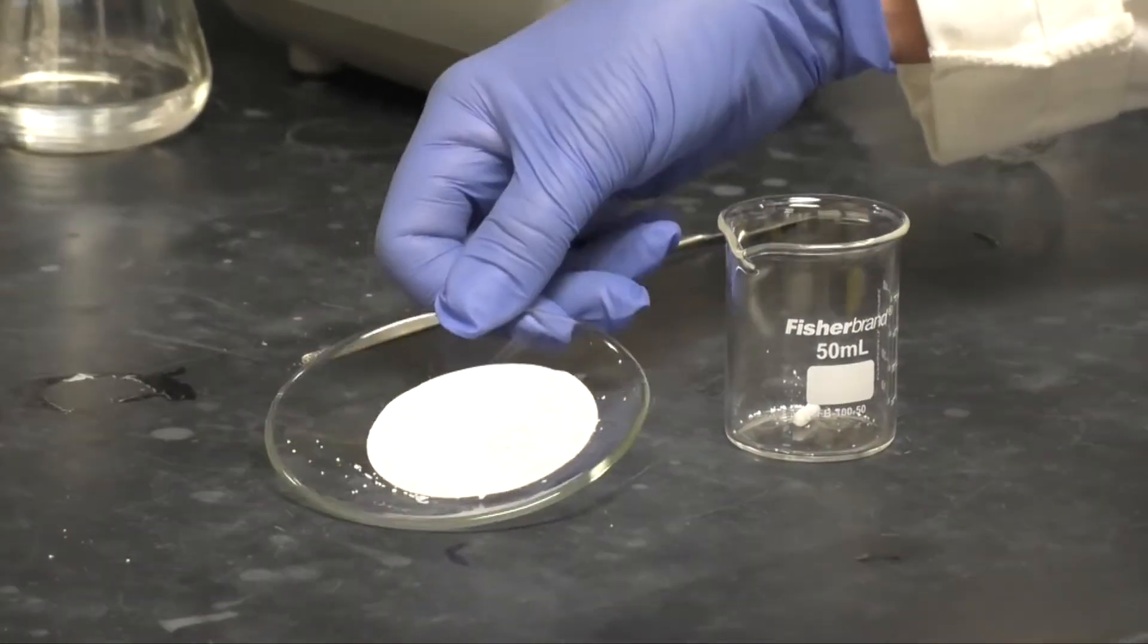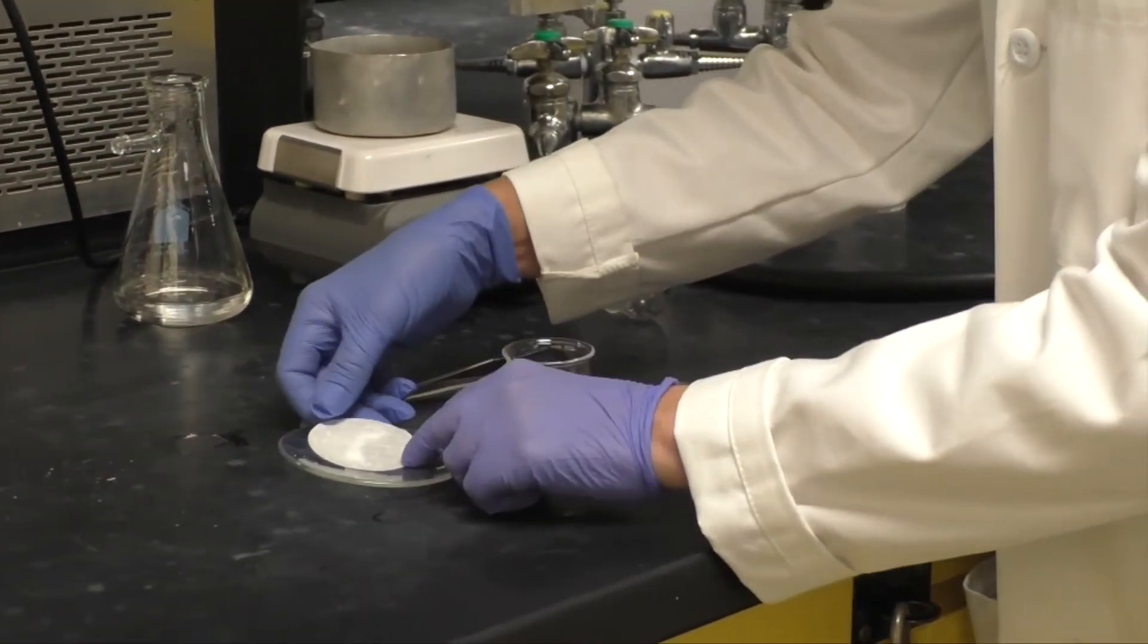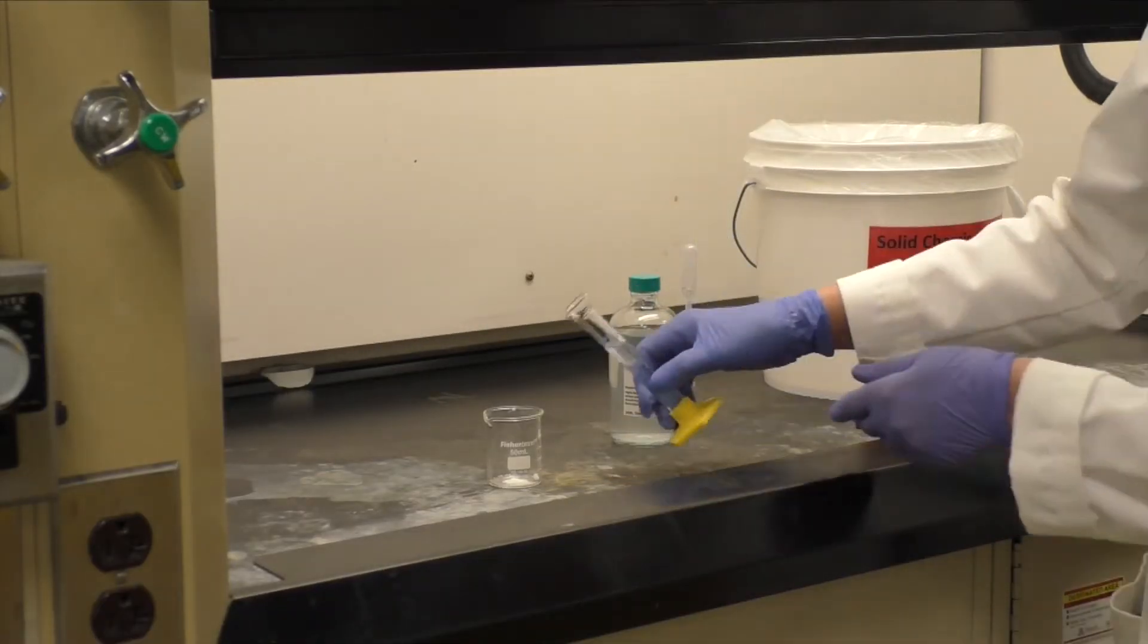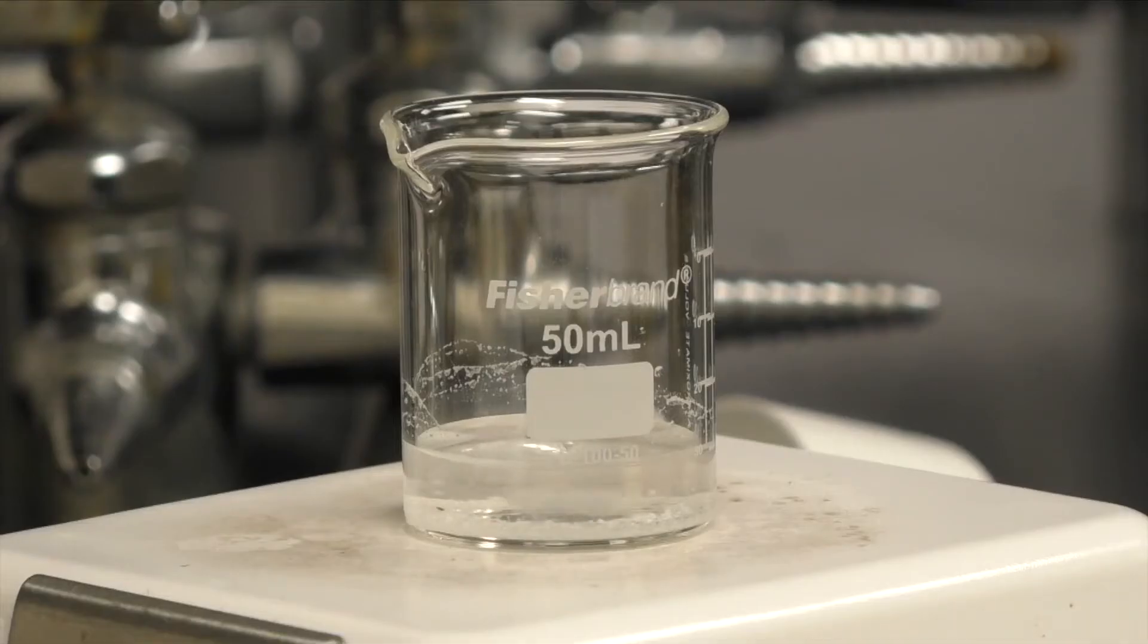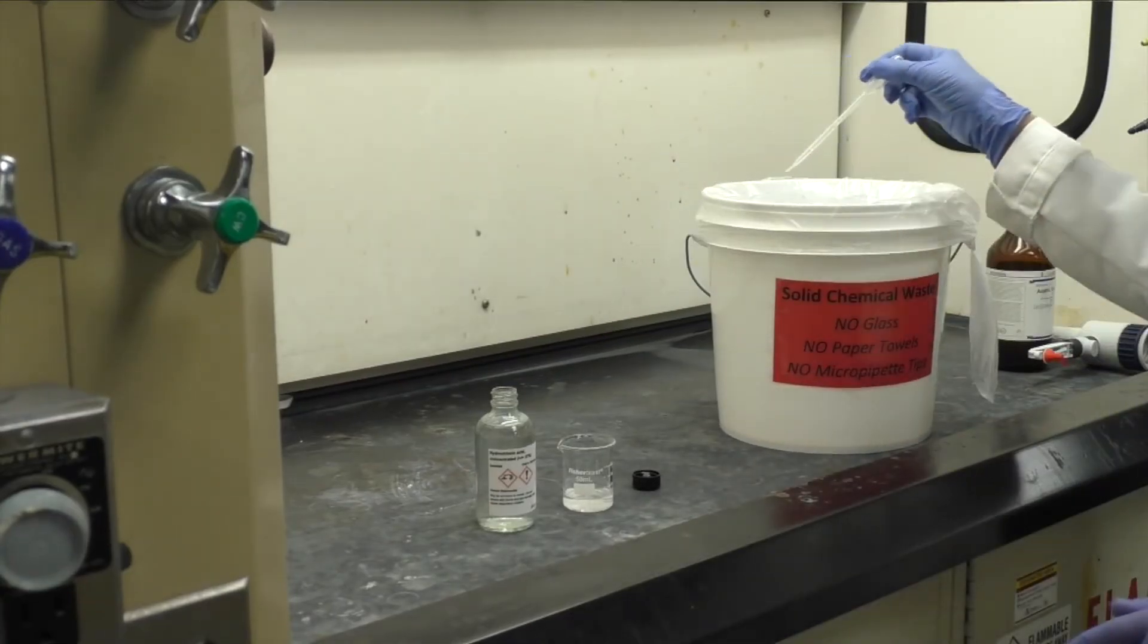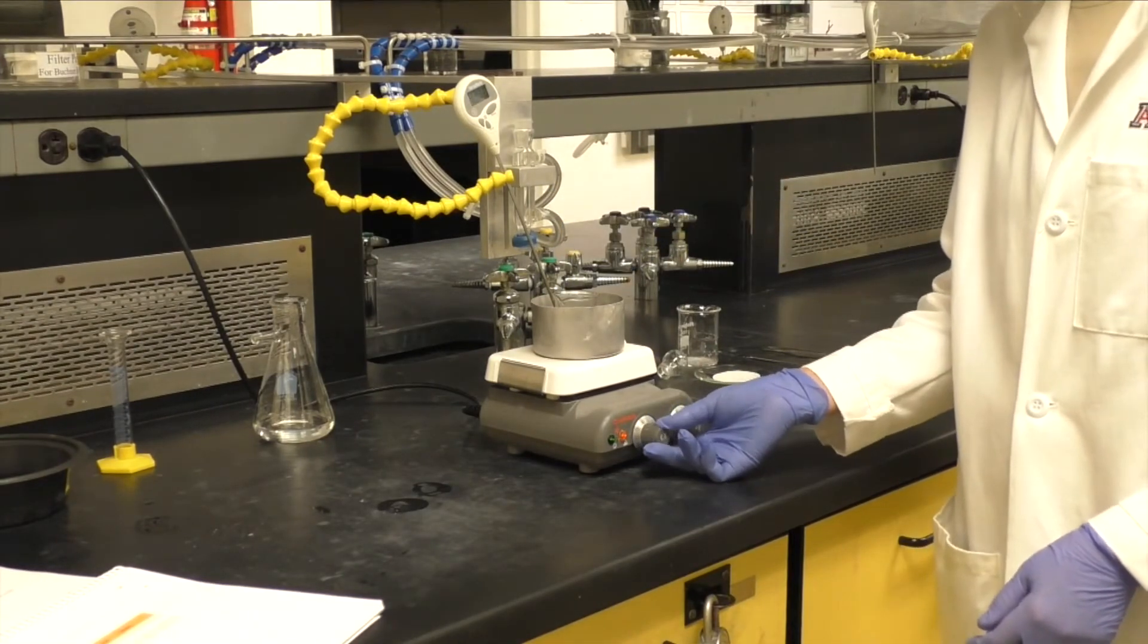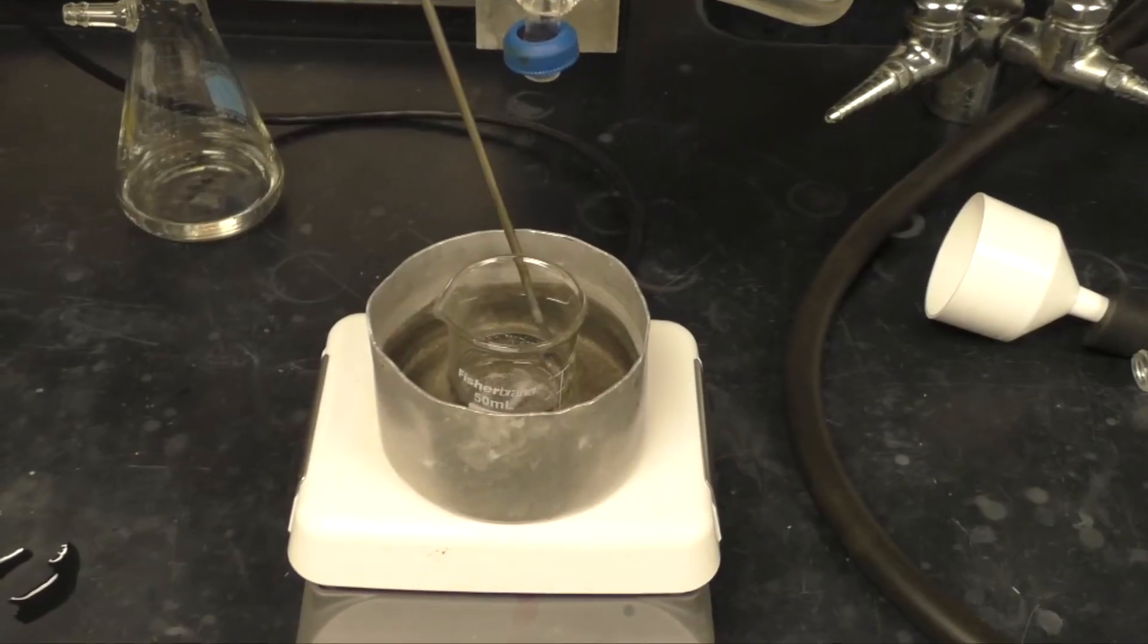Transfer your crystals into a clean 50 milliliter beaker containing a stir bar. Add 10 milliliters of 25% acetone in water and stir. Then add 2 to 3 drops of concentrated hydrochloric acid. Heat the mixture in your water bath while stirring at 60 to 80 degrees Celsius for 10 minutes. Do not allow the mixture to boil.